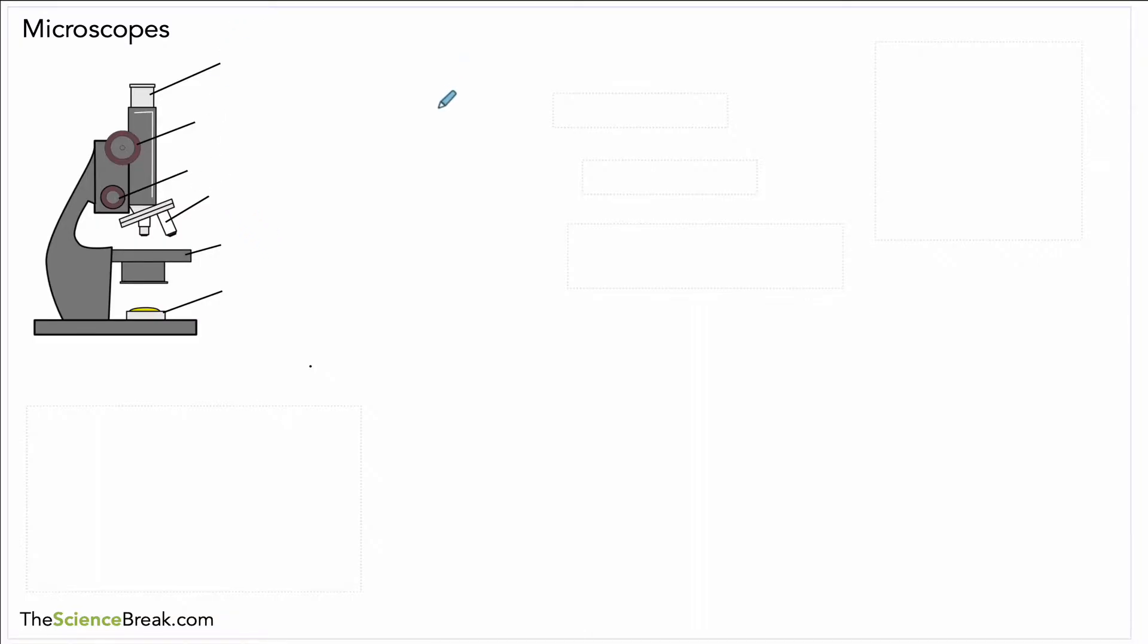At the very top we've got the eyepiece. The eyepiece is the part that you look through. Next one down after that is a round knob which is called the coarse focus. Below that is a slightly smaller one, that's called the fine focus. Then below that we have some lenses with a special name - we call those the objective lenses.